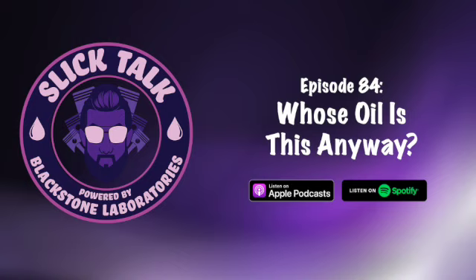I've talked a lot about sodium on this show and how some oils like Valvoline might use a great deal of it, Brad Penn being another. And then you'll have a lot of other gasoline engine oils that use no sodium at all, like AMSOIL doesn't use a significant amount. So if you were to compare an AMSOIL sample to a Brad Penn, you're likely going to see very obvious separation in the additive lineup. So you can use additives to help determine what that oil is. If it appears to be the brand or blend that someone told you it is, we can go to those additive elements, and sending in that unused sample for comparison can be helpful.